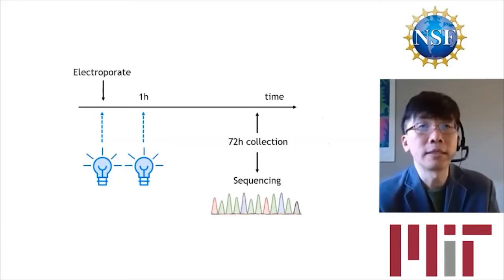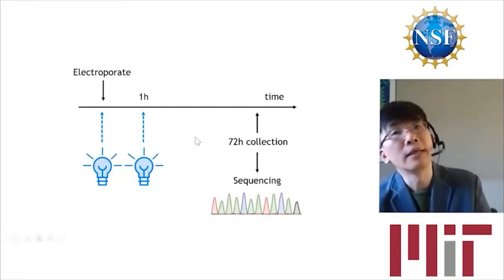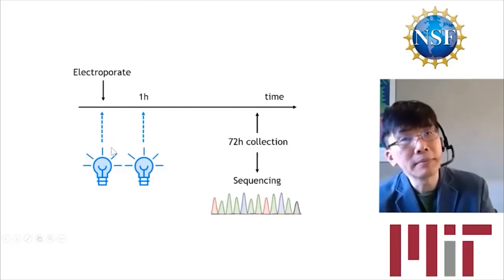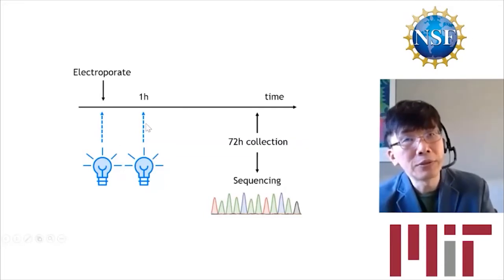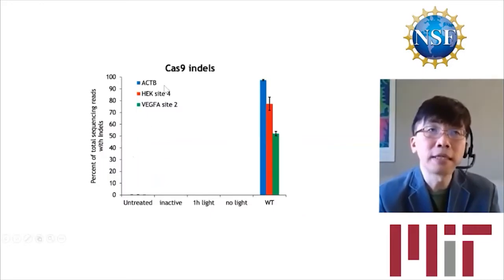To test this method, we use electroporation to deliver Cas9 plus photocleavable RNA into the cells, and then we harvest the cells 3 days later for sequencing to score DNA editing efficiencies. We can inactivate the Cas9 system slightly before cell delivery, or 1 hour into cell delivery. In this second case, we give the cells Cas9 activity for 1 hour before we turn things off. So we're plotting the insertion deletion yields in percentage after 3 days.